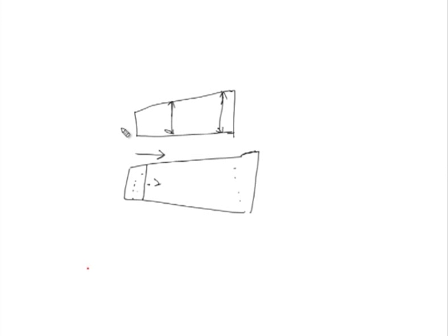As you start, you get a peak which is sharp, but as this peak moves, the height of the peak starts diminishing, and subsequently the peak spreads out, and finally it is quite spread out, because of the shape of the cell. The Schlieren system is very widely used, likewise the absorption system, depending on your application.